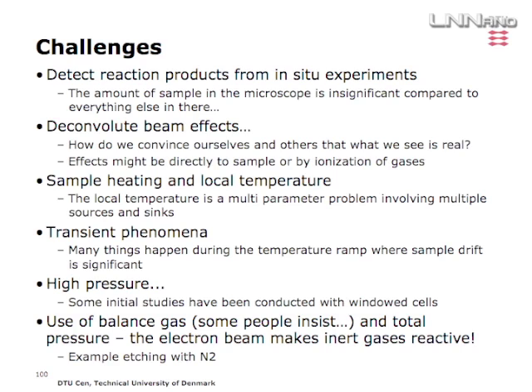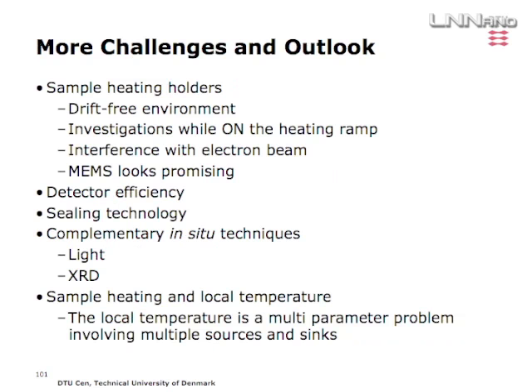And obviously, high pressure, we can only go to a limited value for the pressure. And some people do insist on using balanced gases when they come to us, but again, you don't want to do that. And even the balanced gas, which is quite often nitrogen, can have some effects on your sample.